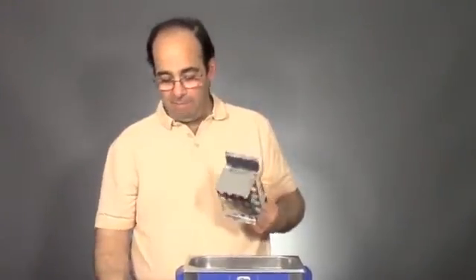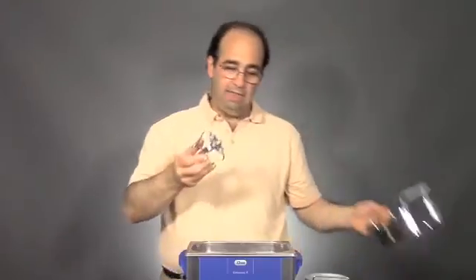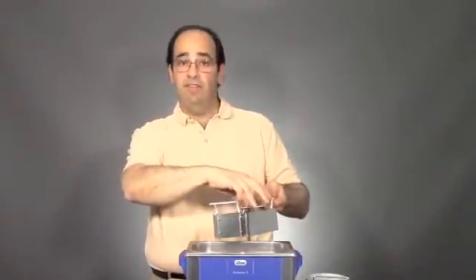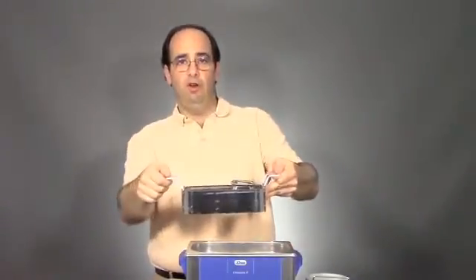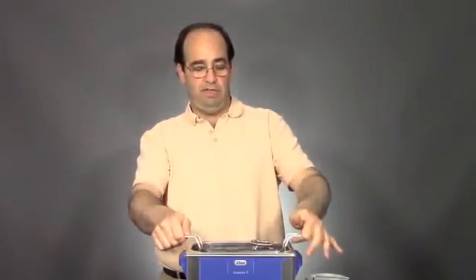If you're in a science lab and doing some samples, you've got some Erlenmeyer flasks you need to sonicate. These clamps are great. They come in a bunch of different Erlenmeyer flask sizes, and this item attaches to the bottom of the basket. You can snugly fit your Erlenmeyer in and just sonicate away.